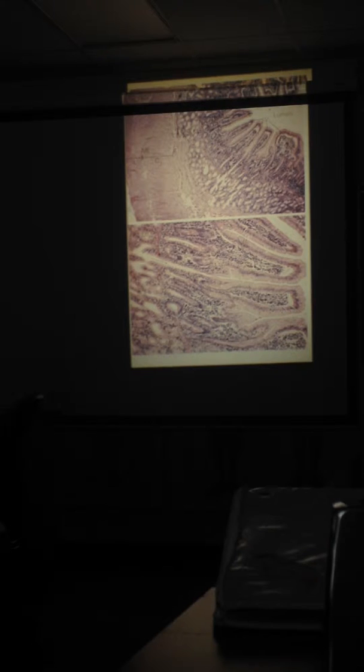All right, so now we've moved out through the pyloric sphincter. We're into the small intestine. You see the fingers. The villi, quite obvious, automatically tells you you're in the small intestine. And then you get to the base of the fingers where you get these little pockets. You see them here more magnified.